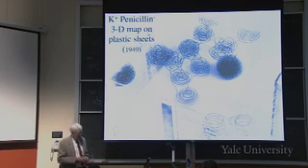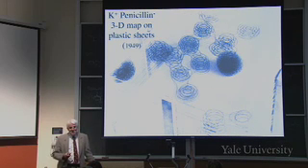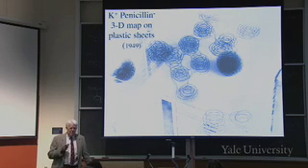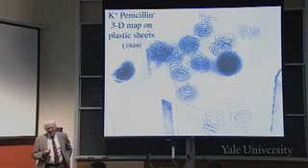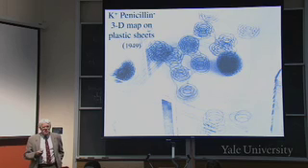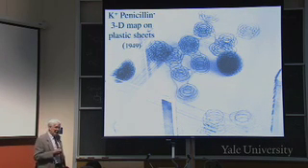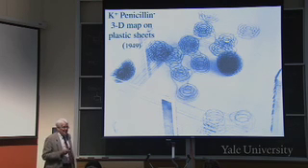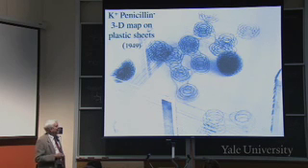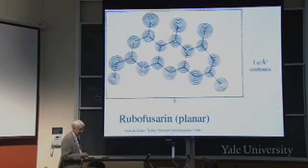So this was the model made for the first determination of the structure of penicillin. In fact, the potassium salt of penicillin. Where's the potassium atom? How can you distinguish potassium from nitrogen or carbon or hydrogen or oxygen? It'll have a lot more electron density. So do you see it? All right, there's the potassium, lots of density.